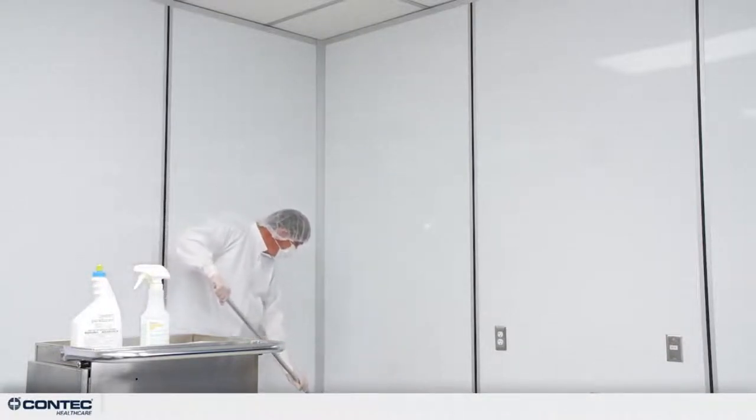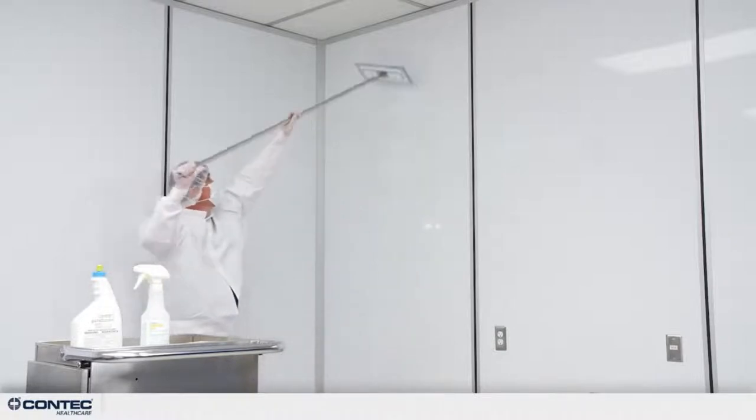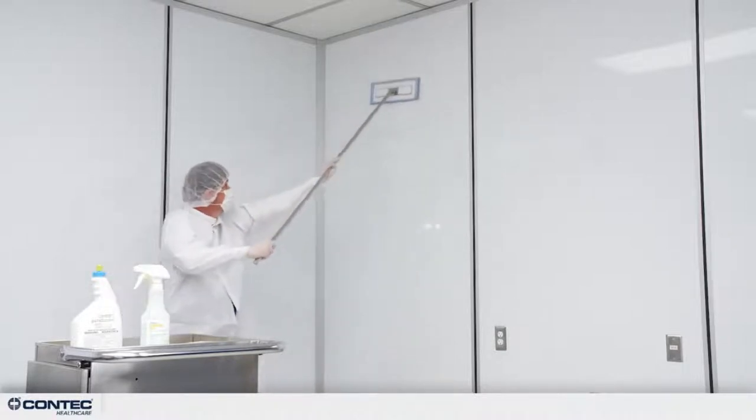If you're painting and you miss a spot, you see it. But if I miss a spot while I'm painting with disinfectant, that becomes a harbor point for bacteria, a place where something can grow and eventually lead to harm to a patient. So use dedicated tools for your clean room that are good at being paintbrushes. Very methodical way of going about that process. And you've got to make sure about the application of the disinfectants as well.